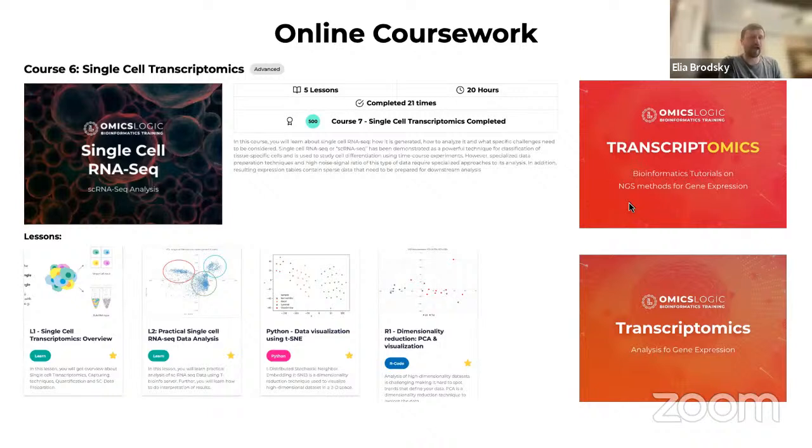If I measure the average temperature across all of these different conditions, I will get a normal temperature. But at single cell level, I am going to start to distinguish between the departments, and I can say, here's my acute patient department, here's the dead, and here are the normal people, right? So I can start to distinguish. And that is really one of the benefits of having such resolution.